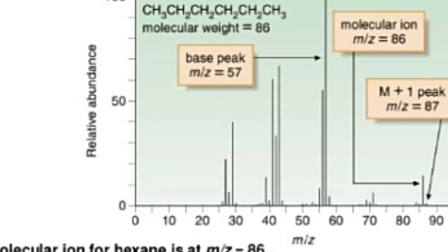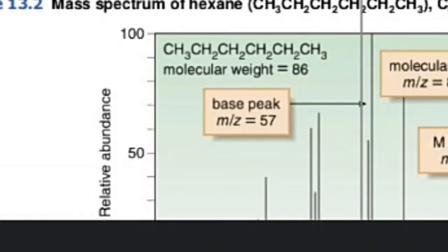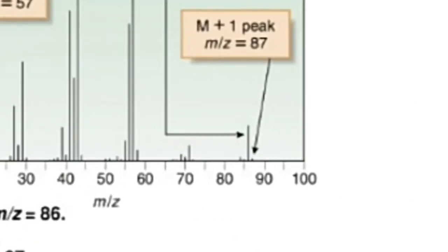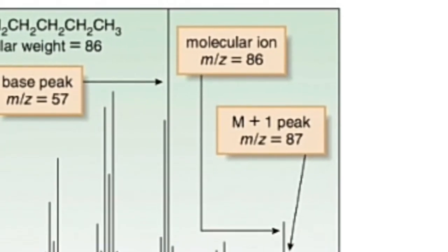The base peak is the largest peak, which is at M/Z value 57. But the molecular ion M/Z value is 86.